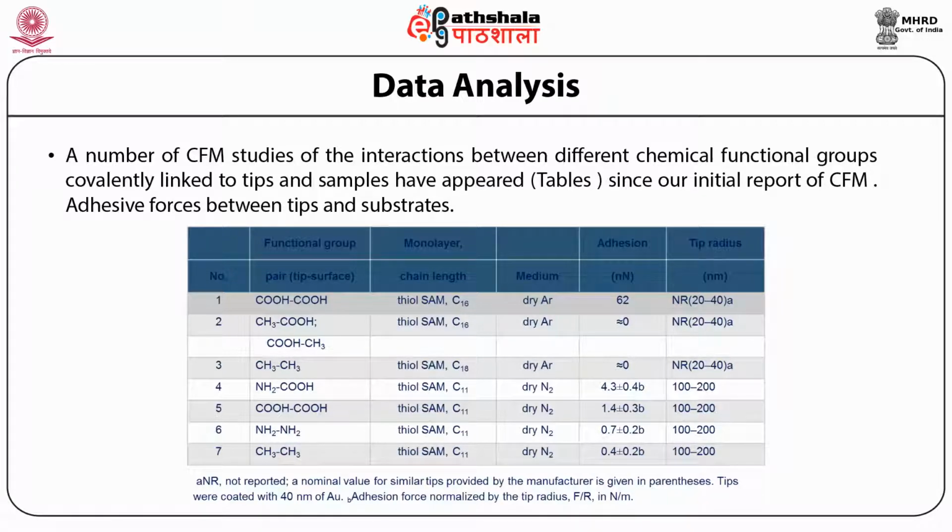Adhesive forces between the tip and the substrate ultimately determine the data given here in the table.